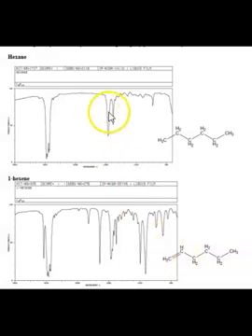Okay? Now, if we go up here, we can also see that's pretty much the same as the one that we had before. And this one is also in there. Okay? It just looks like this got a little bit larger in size. But now look at this. We have the presence of two more peaks. It just looks like we have more stuff going on here with hexene.